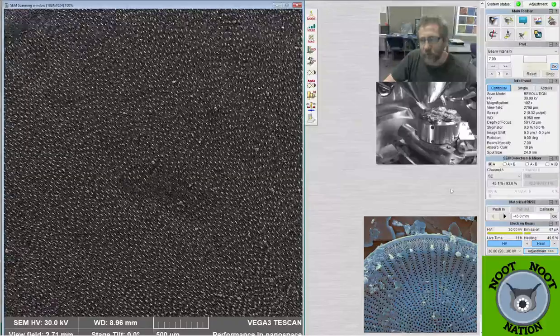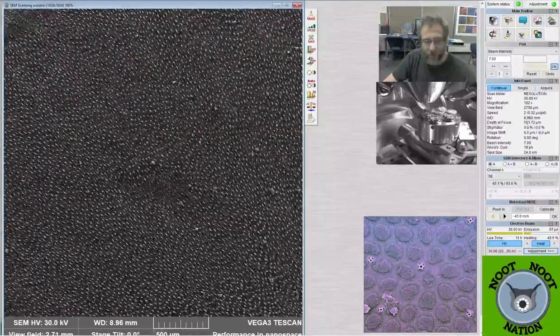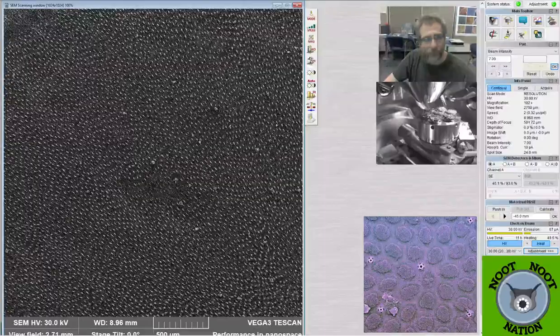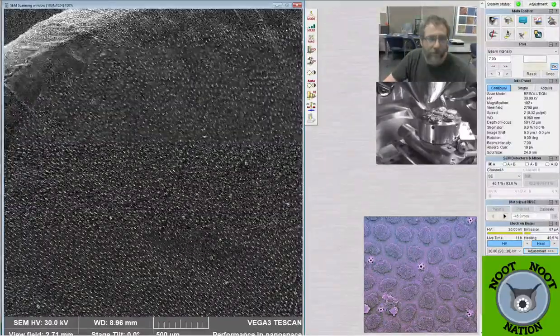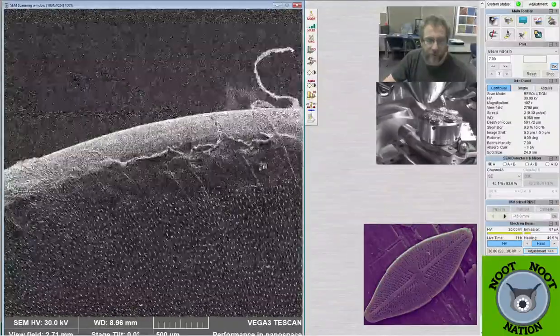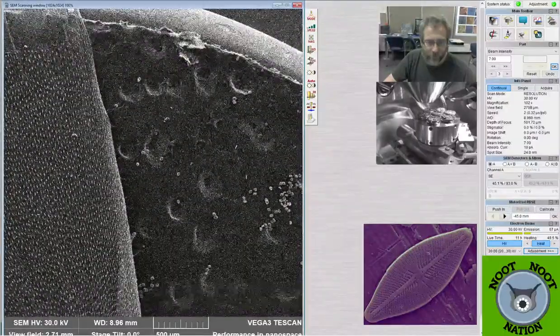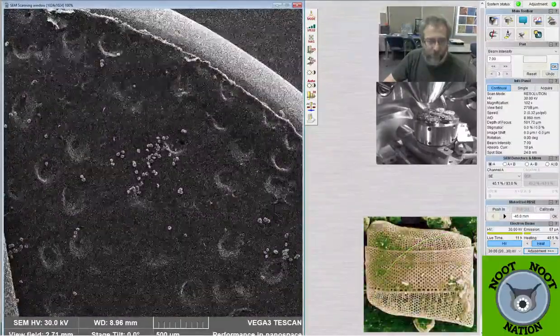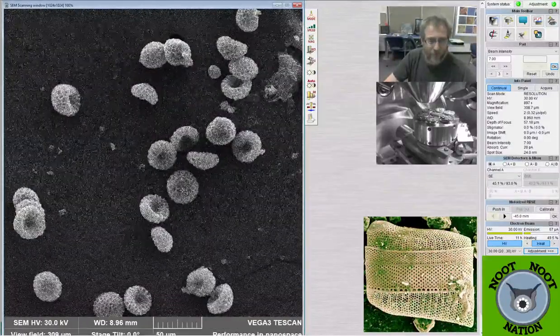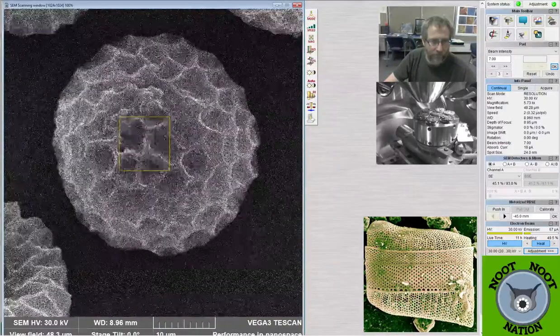But when you're zoomed in, you can see now our depth of focus, as I zoom out to the maximum magnification where I am, the depth of focus is now 500 microns. So it will have everything in focus at once if I took this picture. And that's actually, you know, kind of similar to normal camera work. If you're used to using a camera where you have to work on the aperture, there's no aperture, or there is kind of an aperture for the SEM, but as we zoom in and out, basically it gets adjusted automatically.